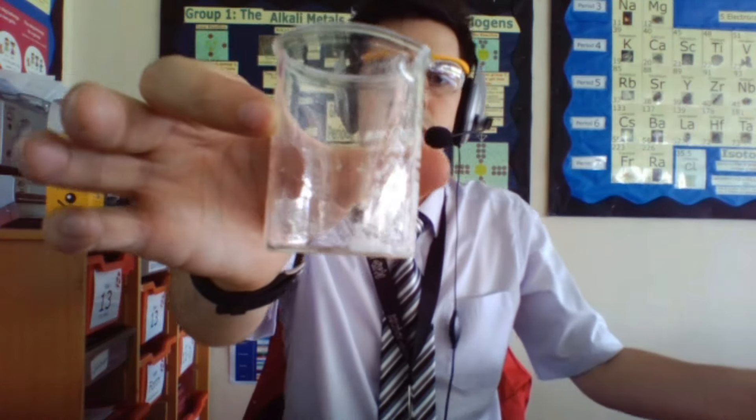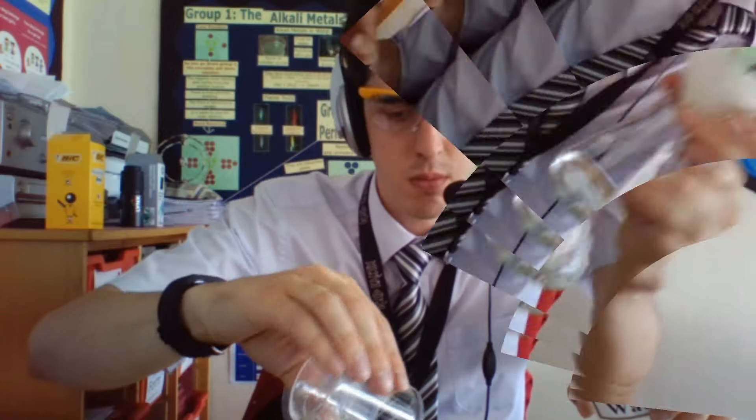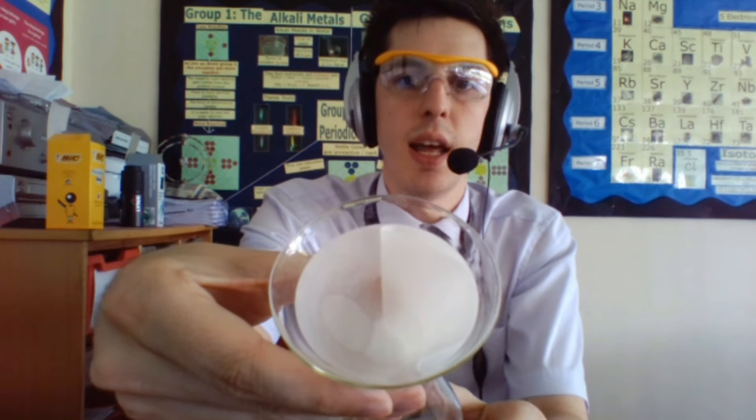Now you'll notice there's still some of the solid left in the beaker, so what you need to do is just wash it through. So what we've got in here then is the solution at the bottom which is our sodium nitrate, and then up at the top which is filtering through is our lead chloride, which is our insoluble solid.